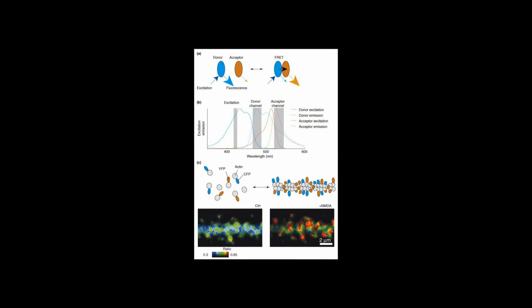See also: Phasor approach to fluorescence lifetime and spectral imaging. Fluorescence excited state lifetime imaging. Lifetime and spectral analysis tools in ImageJ. spectroscopy.com. Fluorescence lifetime imaging microscopy.